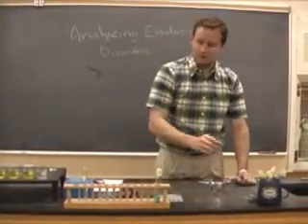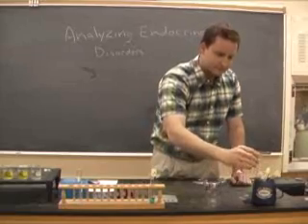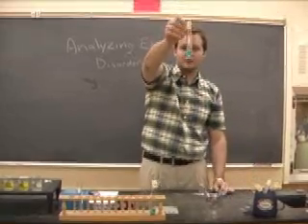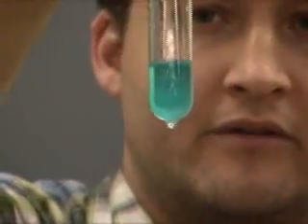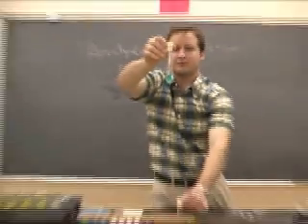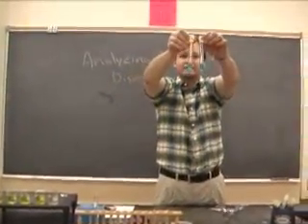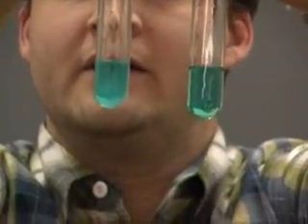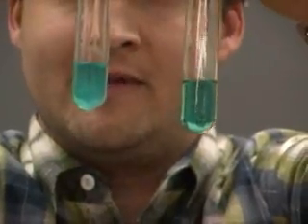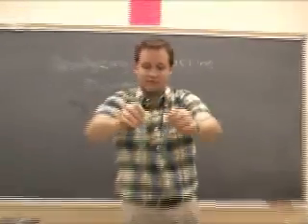Okay, let's find number B. Again, what we're looking for is the formation of a precipitate, a cloudier, whiter appearance. Compare this one to the first one, which was negative. I think we can clearly see that is definitely more cloudy. There is the formation of a precipitate there. That is a positive test.